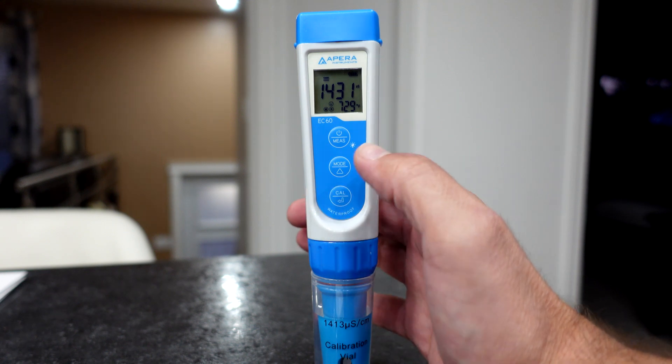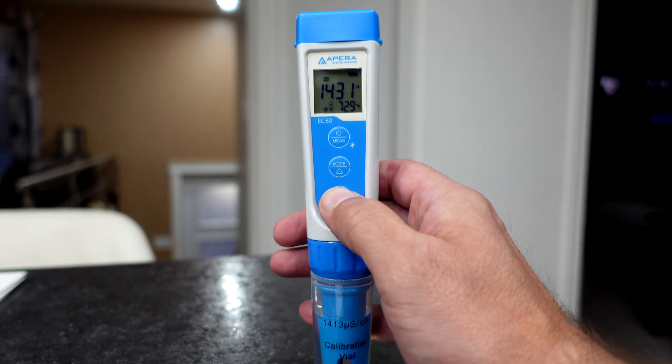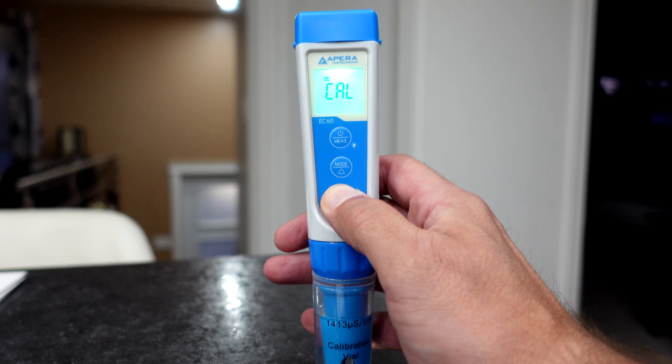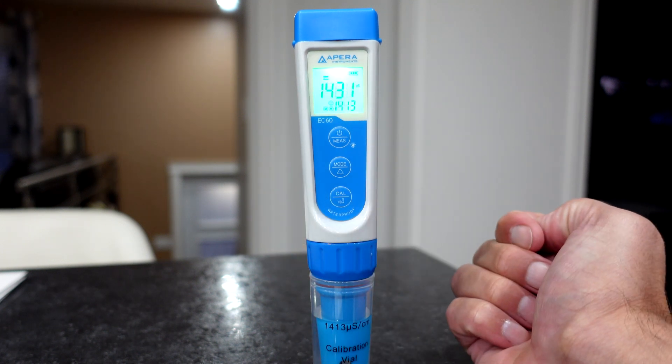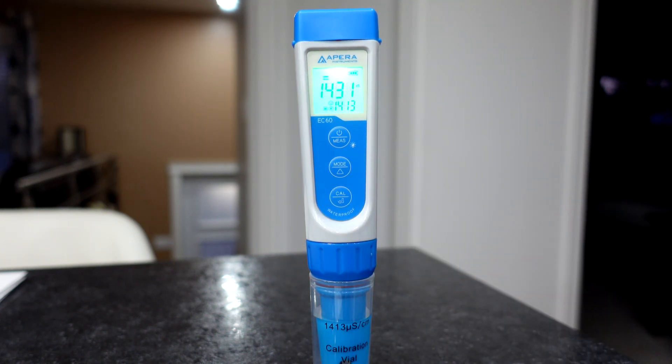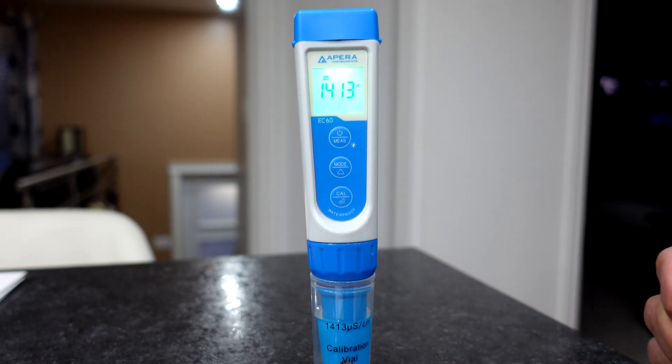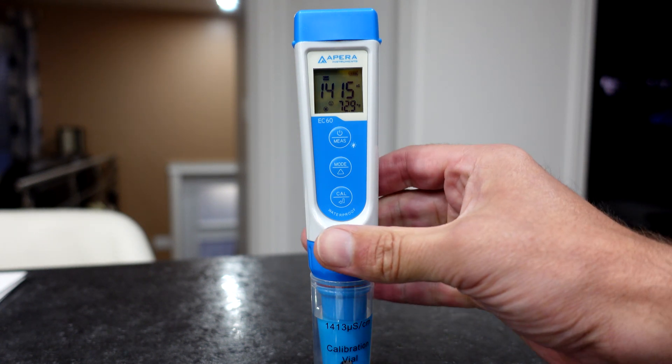So just for the sake of calibrating it, I'm going to calibrate it here so you guys can see that as well. Push and hold — calibrate. 1413 is there. And once it's stabilized, push the calibration button. And that is done.